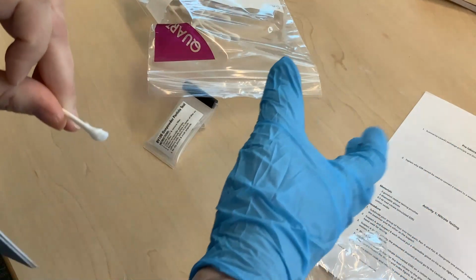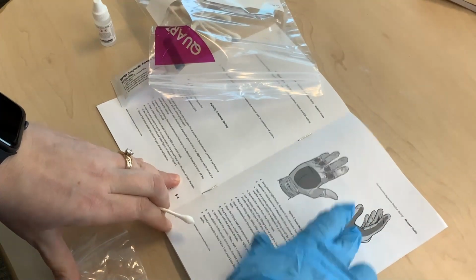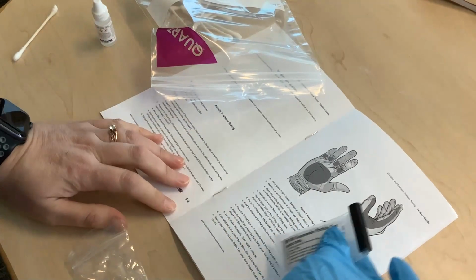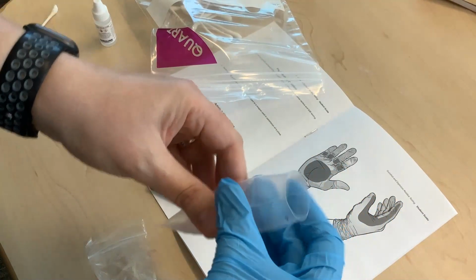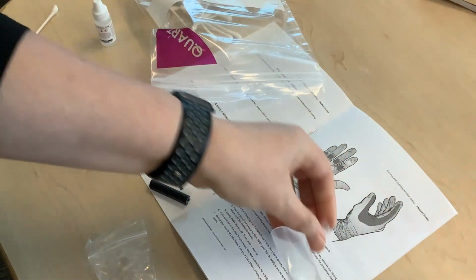So the idea is that this person then shakes hands with the other possible suspect so that you have 2 options when testing. So this is what I just did. I would then shake hands and then you would run the test. The test says you're going to pull this off very carefully, and you're going to remove the tape and the vial, and the vial comes in its own little container here.